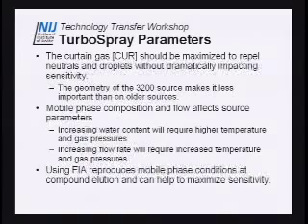All right. The curtain gas, I don't really have a graphic for curtain gas because there's not much to say, except that the curtain gas should be maximized to repel neutrals and droplets without dramatically impacting the sensitivity. In other words, if you're tweaking your curtain gas pressure, increase it until you see your sensitivity start to really drop off, and set it there.